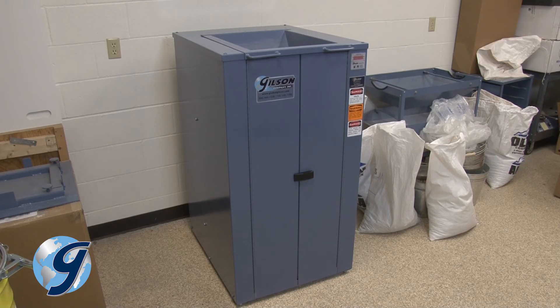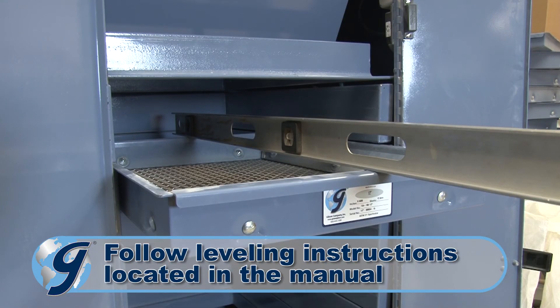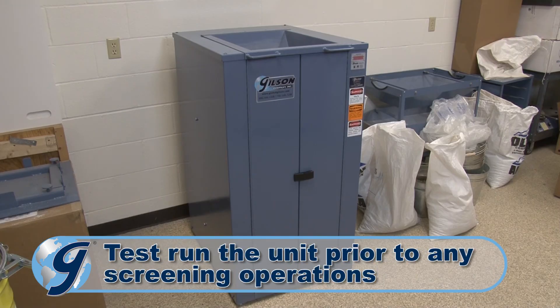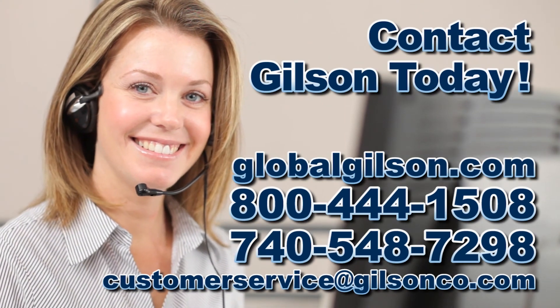It is important that the unit be leveled in the location of operation. Once the Test Master is leveled, the testing screen is ready for operation. For any questions concerning the Gilson Test Master or for any other Gilson product, please contact the Gilson Technical Support Team.